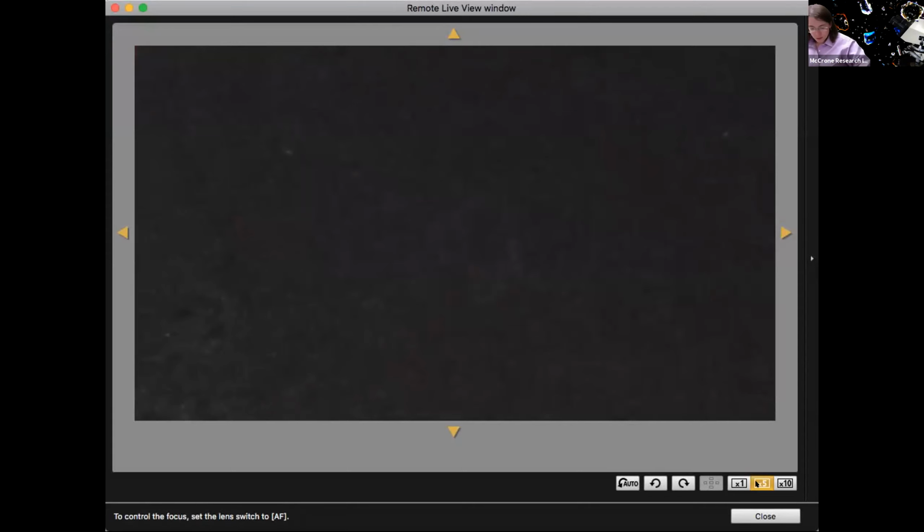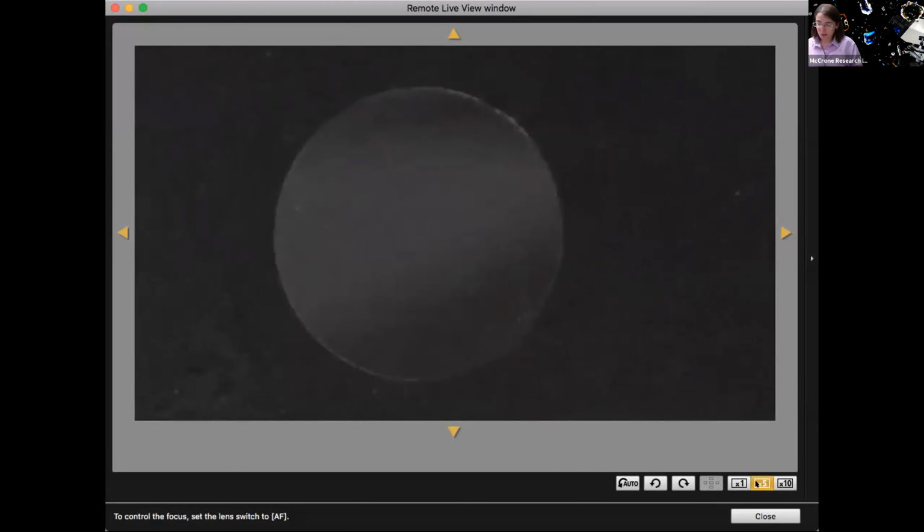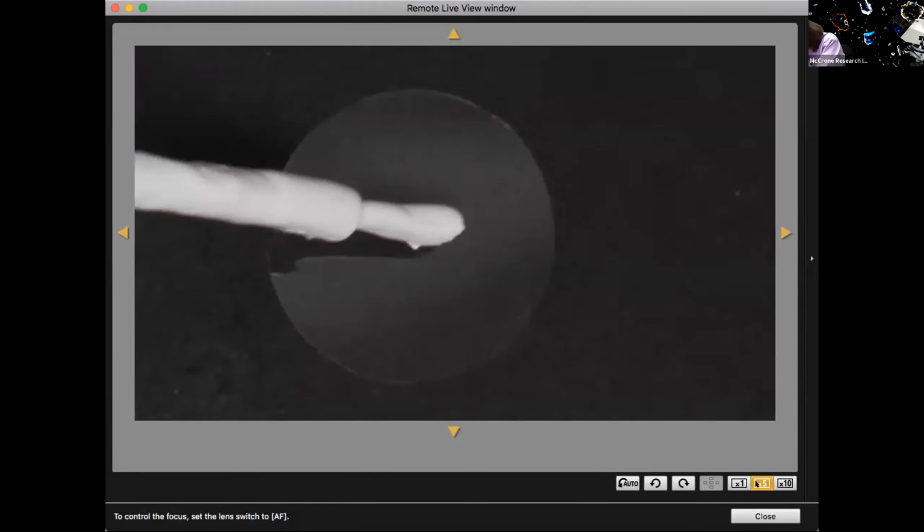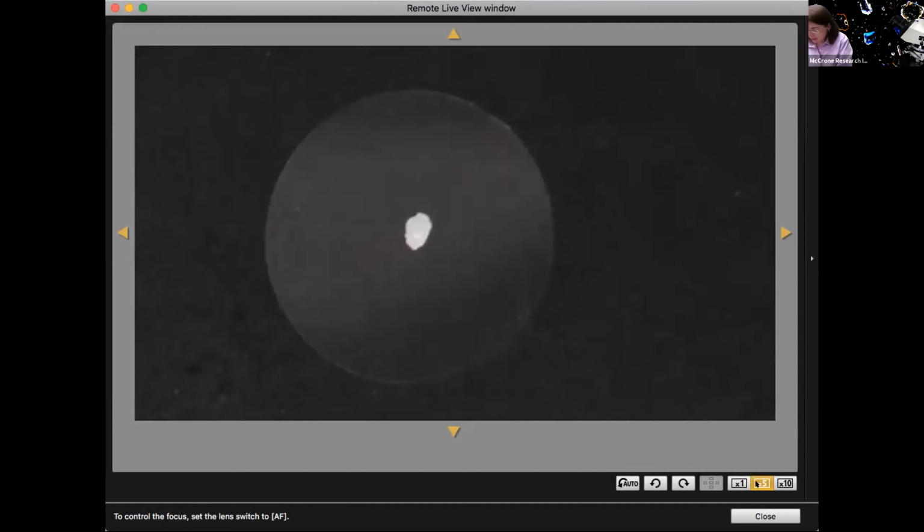And I would also recommend when you're making these, make several. Don't just make one, because you may not have the spot size correct the first time. So if we try and make one here, of course, that first one I didn't even get a very round spot. So you need to make several of varying different sizes. And then before you start to install them into your objective, of course, make sure that it's fully cured.